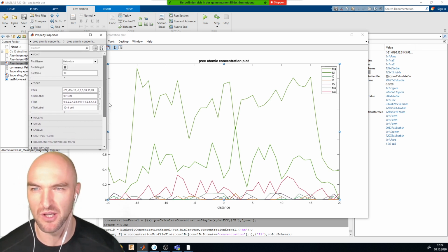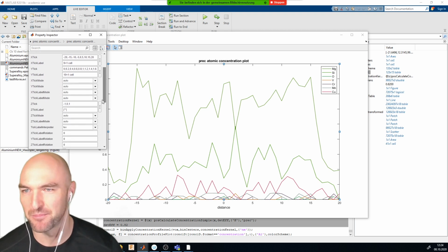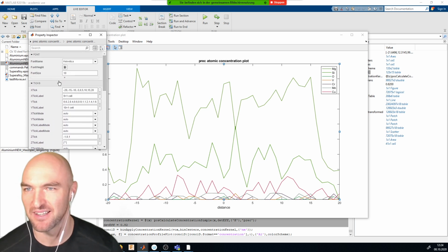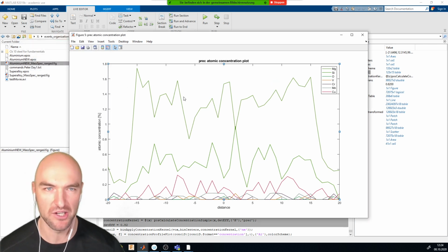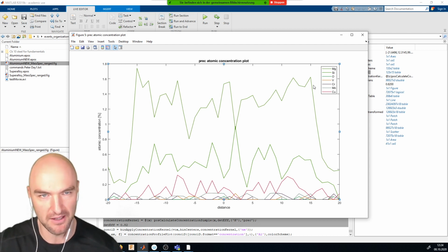Right now I don't know where these things are in the UI, because usually I do all of that programmatically, so I have to look. But essentially, I've shown it to you before. You can just go and change the axis to logarithmic, or change any of the functions in there.